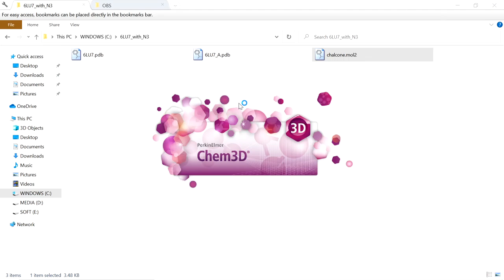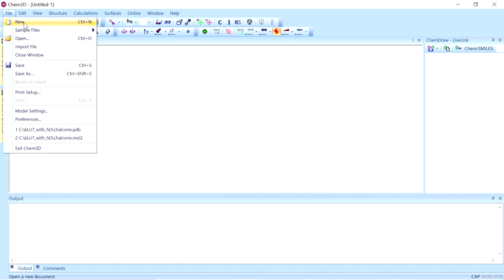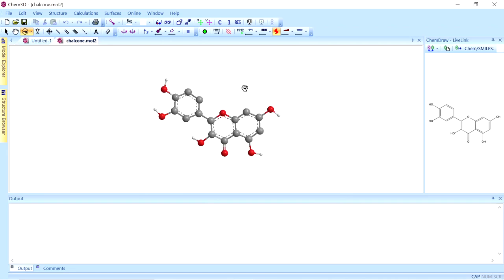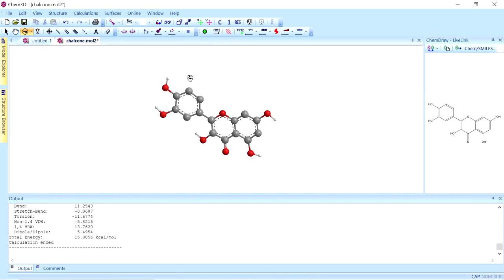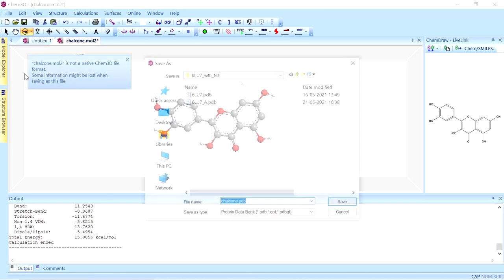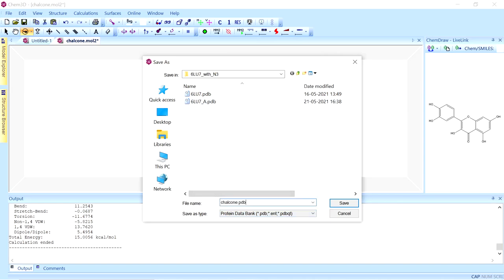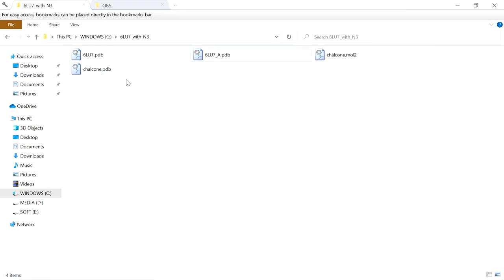Now I am opening Chem3D and importing the ligand file. This ligand is in 2D format. For energy minimization, I am going to use the MM2 force field — click on it and the energy minimization will run. The energy minimization is completed. After that, save the ligand as PDB format in the same folder. We have successfully completed the energy minimization step.